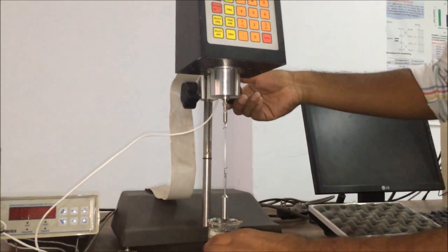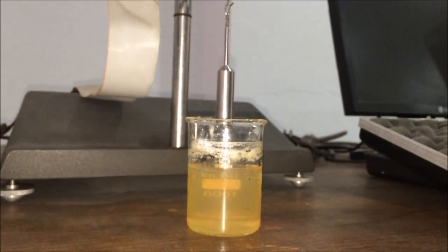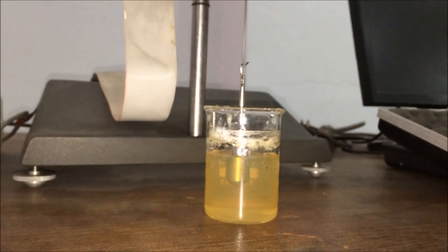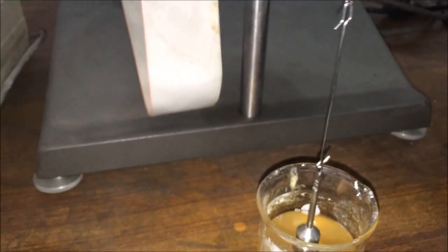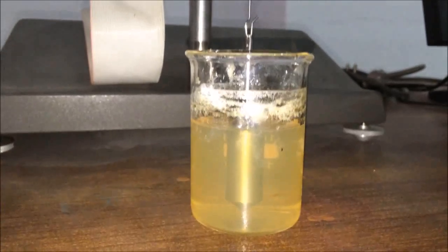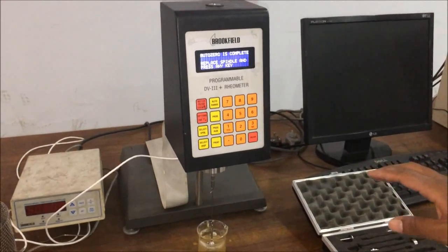Make sure you dip the spindle LV27 up to the point where the curve is just about to end. Also make sure that your spindle is at the center of the beaker. Now after setting the spindle and making sure everything is correct, we will proceed.